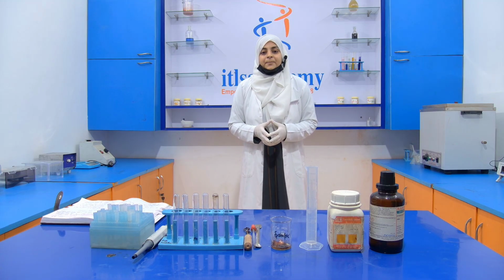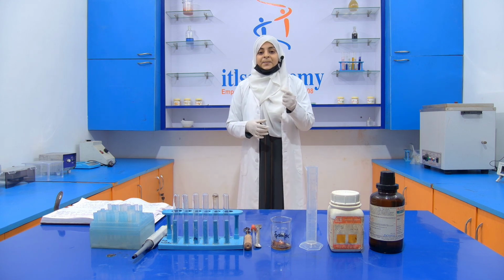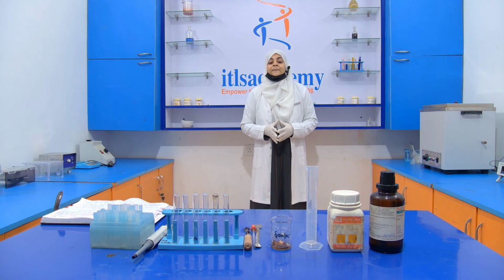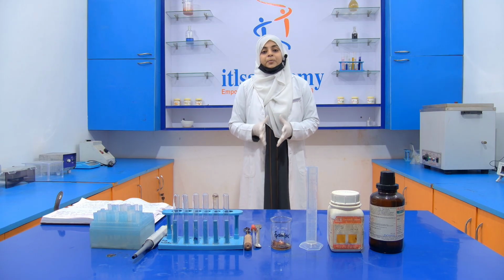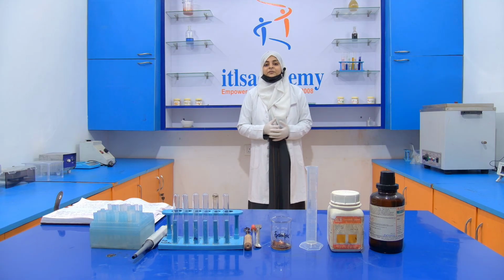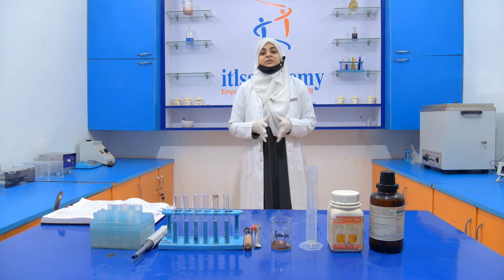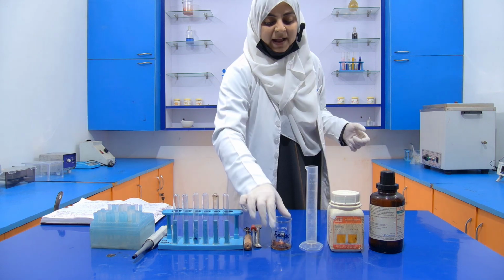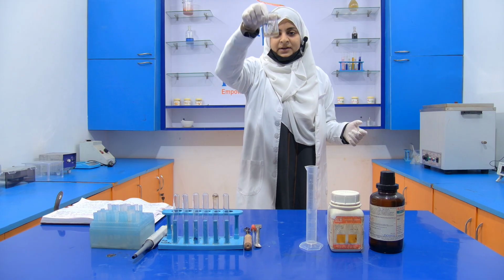We have a Soxhlet apparatus, and we put the milk into a thimble and put the thimble inside the main apparatus. Then we add a solvent. The choice of the solvent depends totally upon the nature of the product, the nature of the fat that we have to extract. According to that, we choose the solvent. Then it takes around 4 hours for the extraction. Then we get the extracted fat.